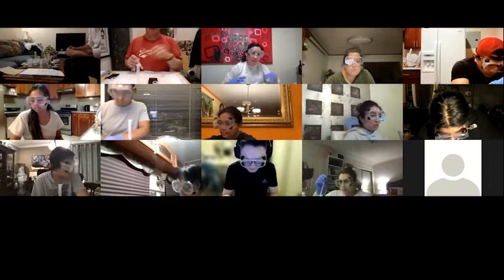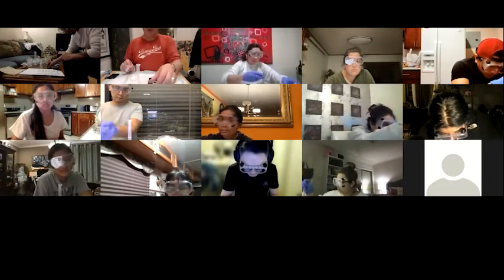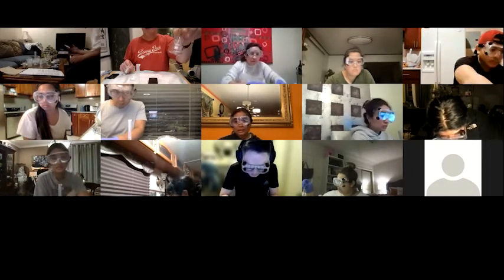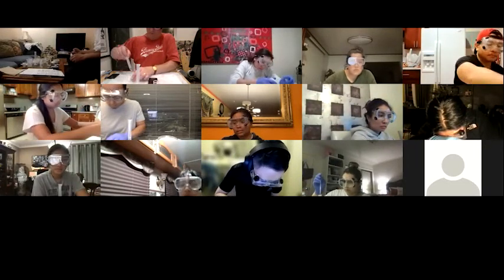It's around 9. It changes around 9. So it's a good indicator for our reaction because the pH at the equivalence point is going to be around 8.8 or so. That's pretty much exactly what we want.